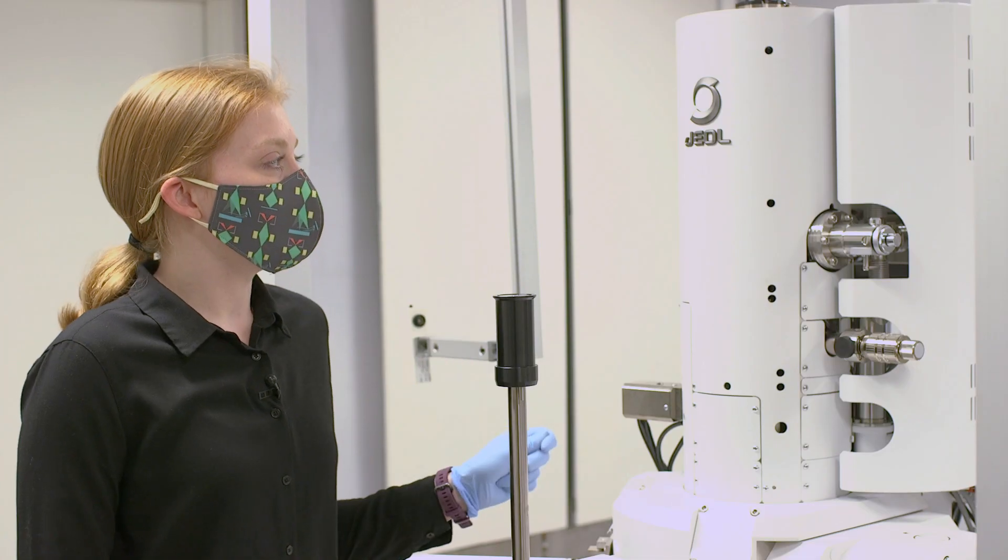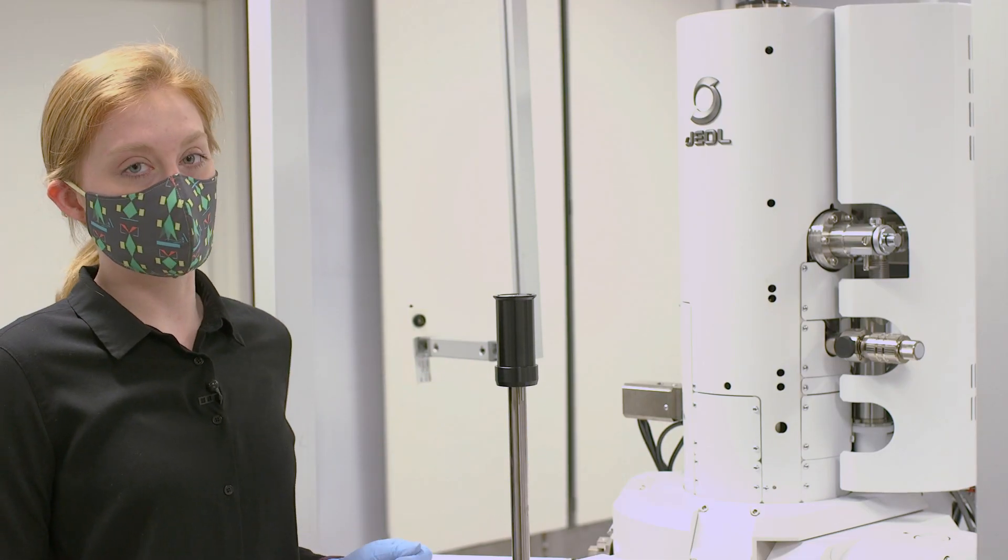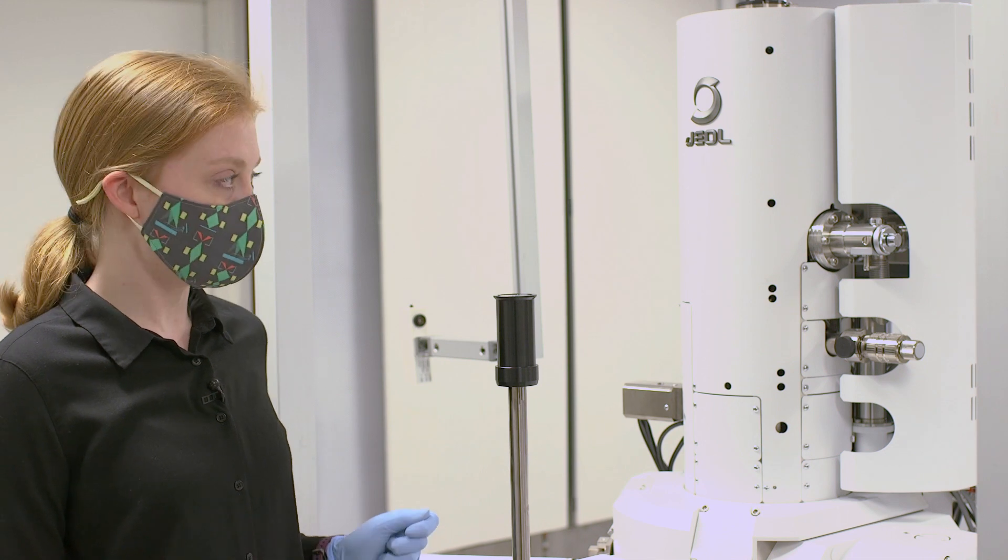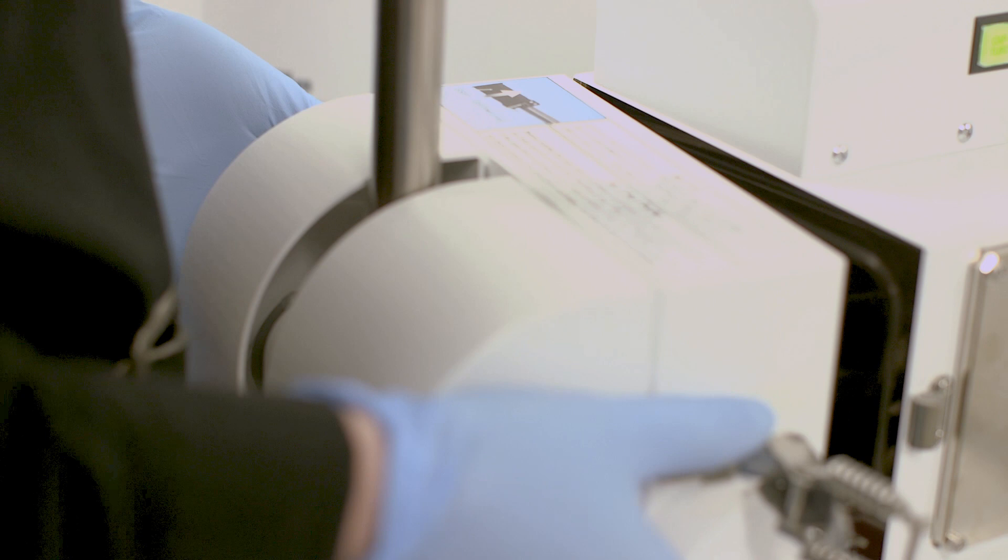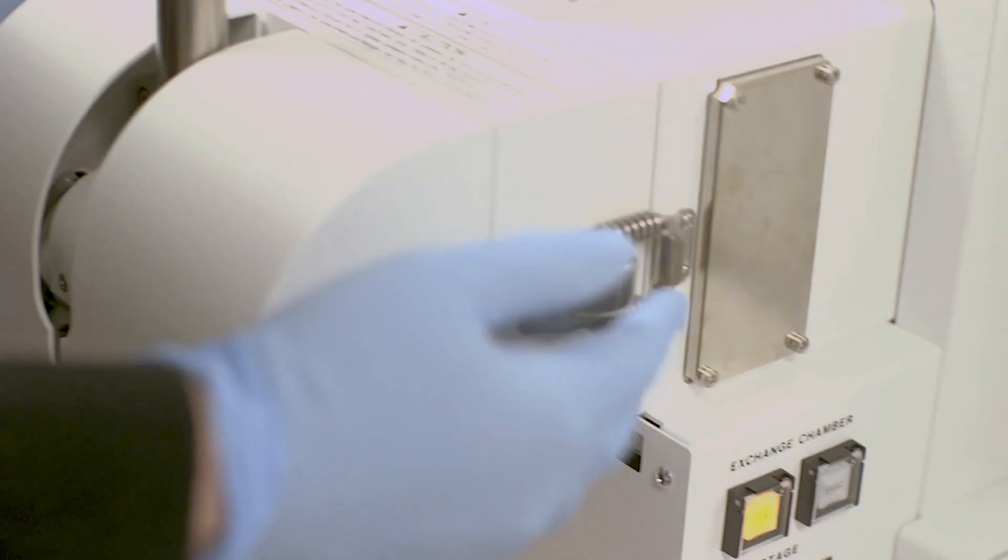The first electron microscope was actually built in 1931 by Ernest Ruska and Max Knoll. And Ernest Ruska actually won a Nobel Prize in 1986 for building the first electron microscope.